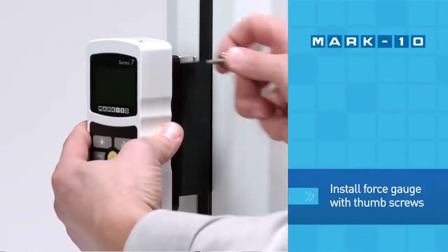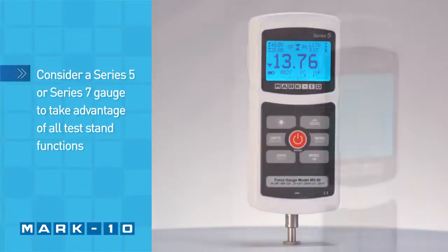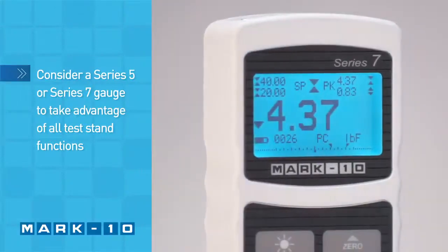Installing a force gauge is simple and it can be easily removed for service and calibration. Consider a series 5 or 7 gauge to take advantage of all test stand functions.